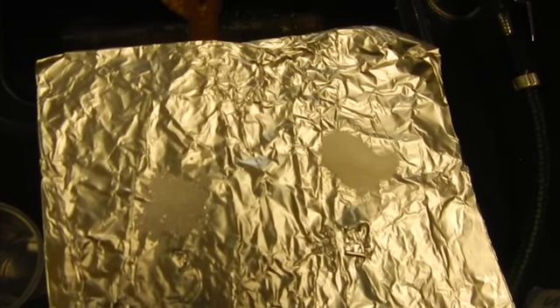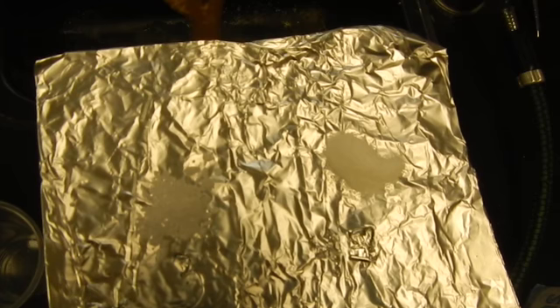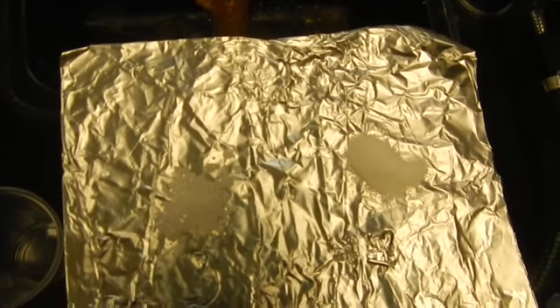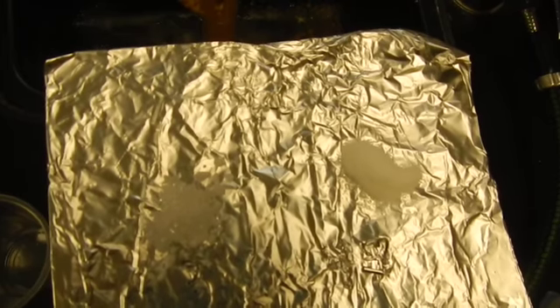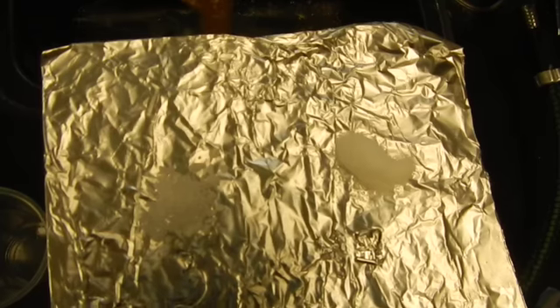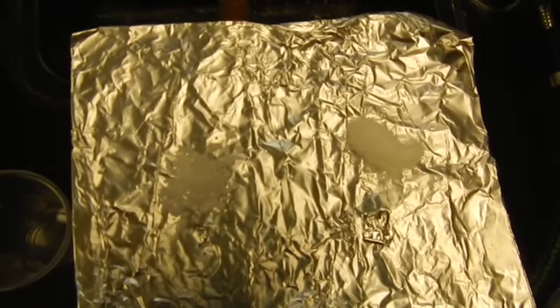Well, now number 4 is starting to melt a little bit as well. So they're both melting relatively low. 3 is so coarse it's making popping noises, whereas number 4 is just slowly melting around the edges. So use this information to fill in the melting point for unknowns 3 and 4.